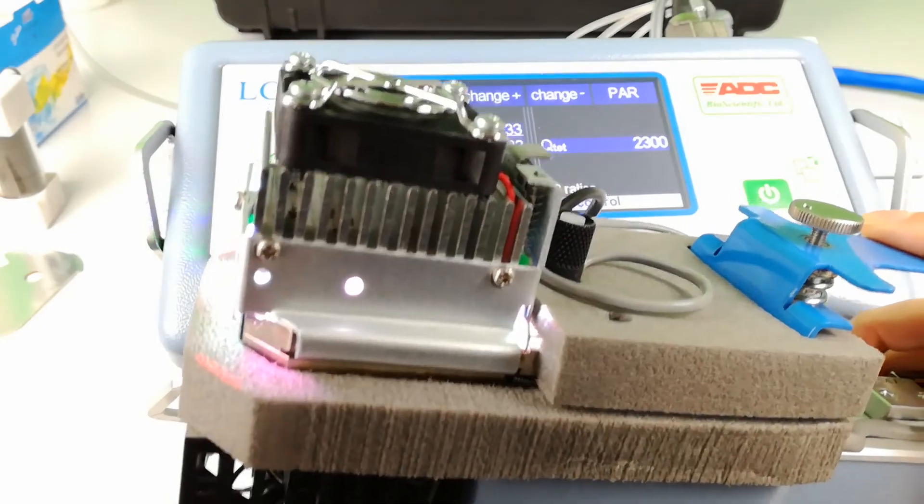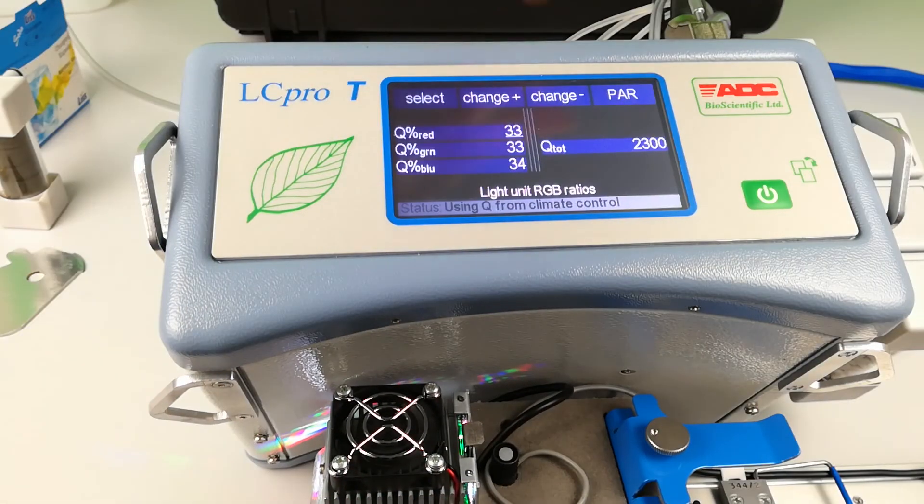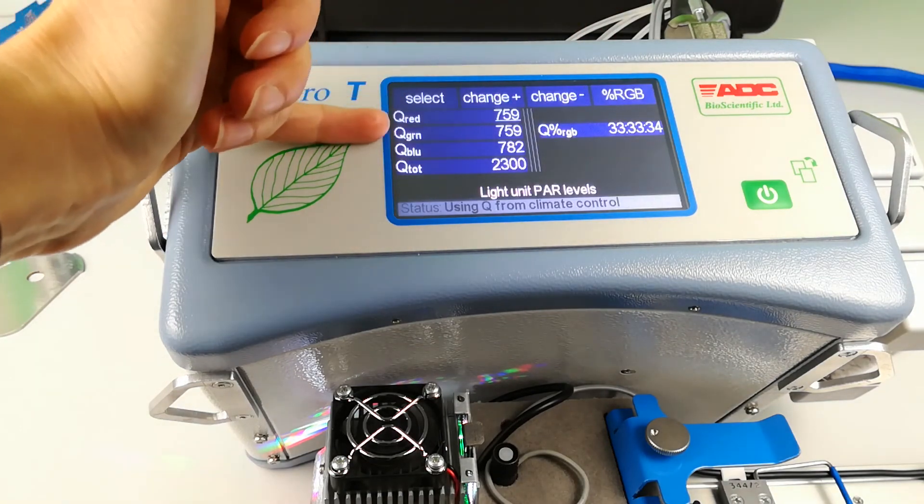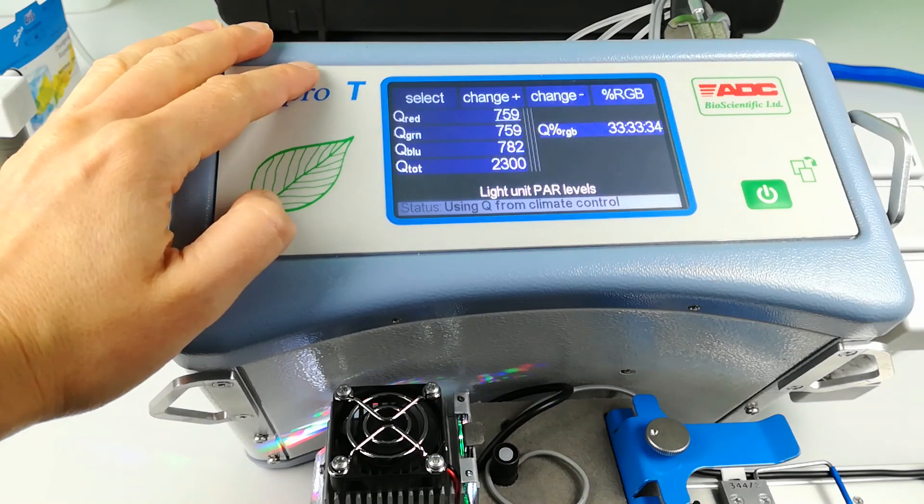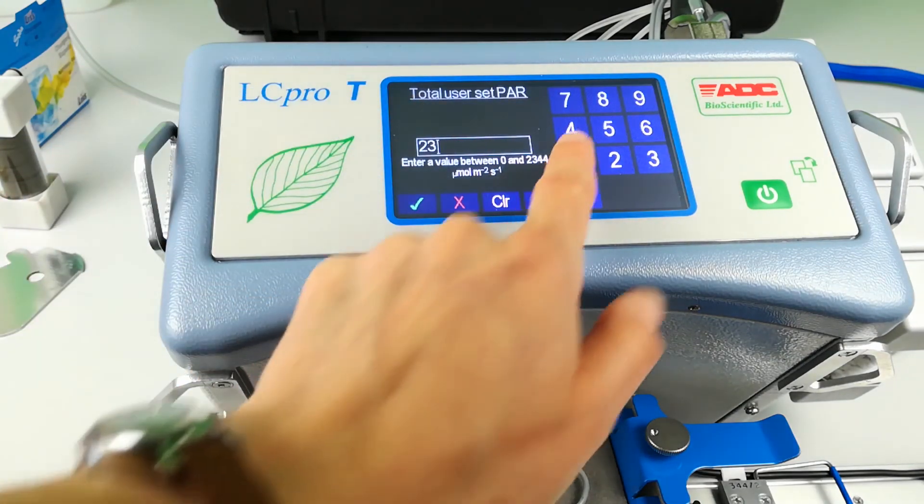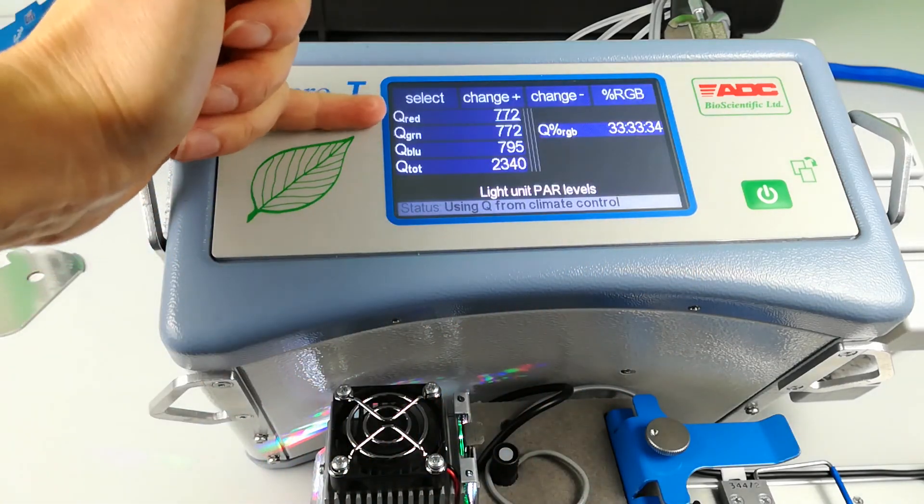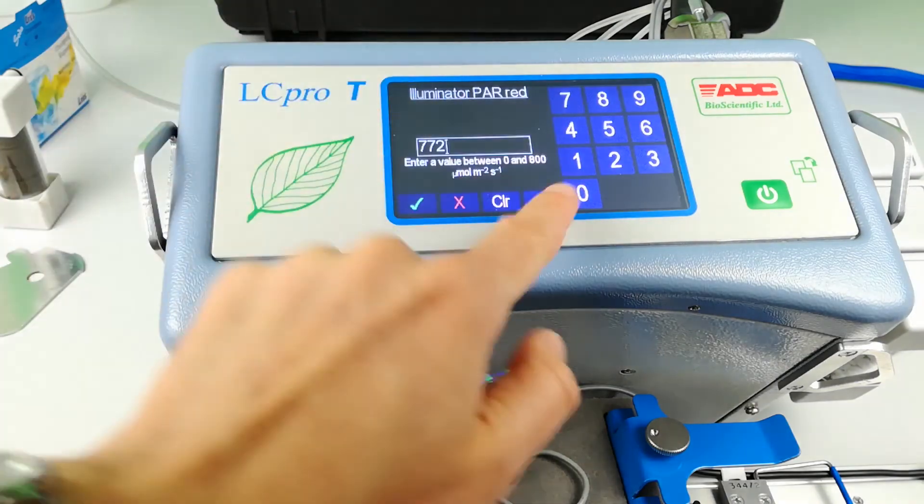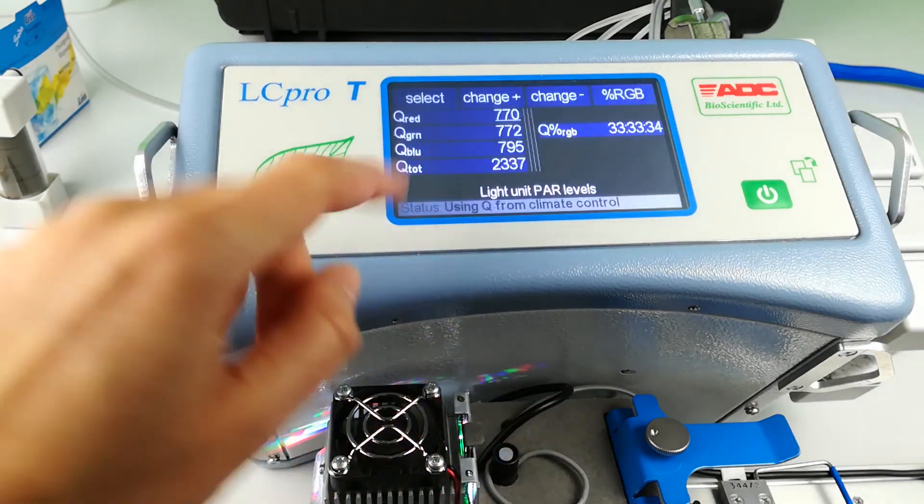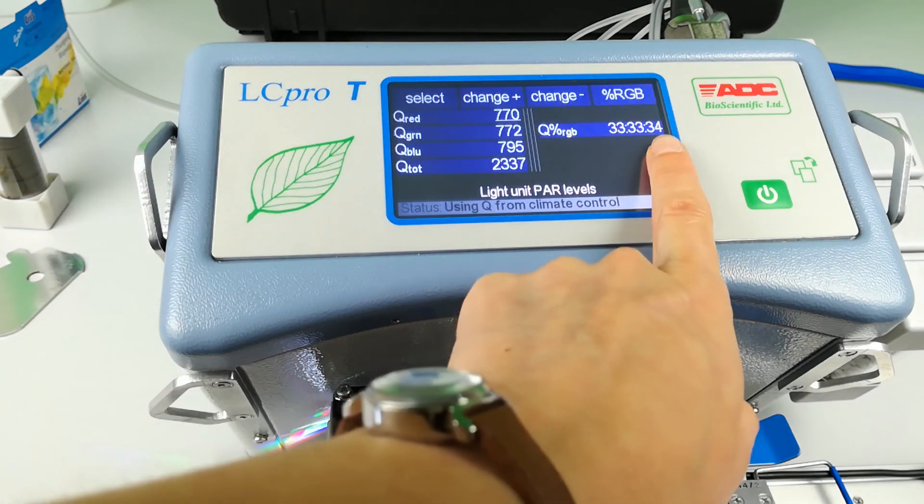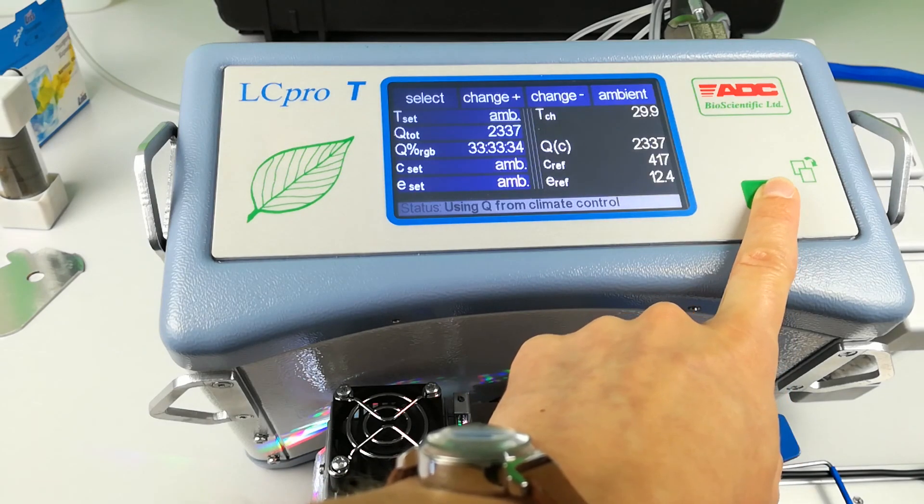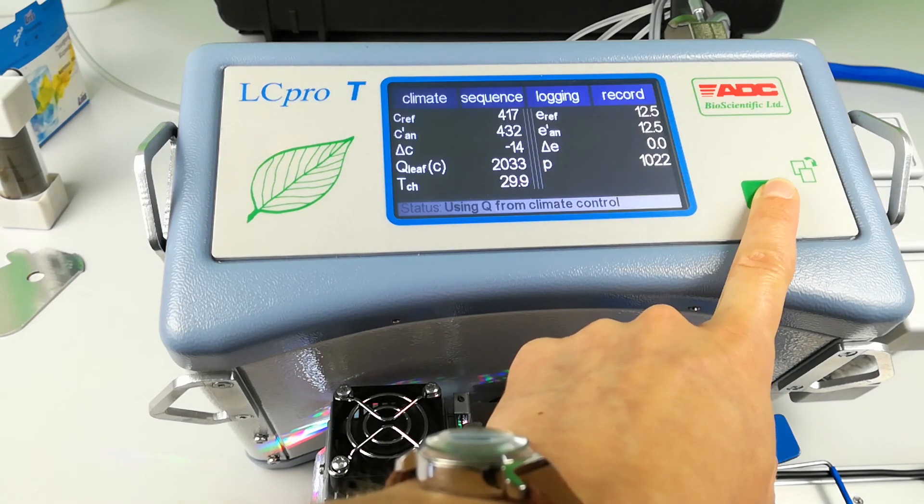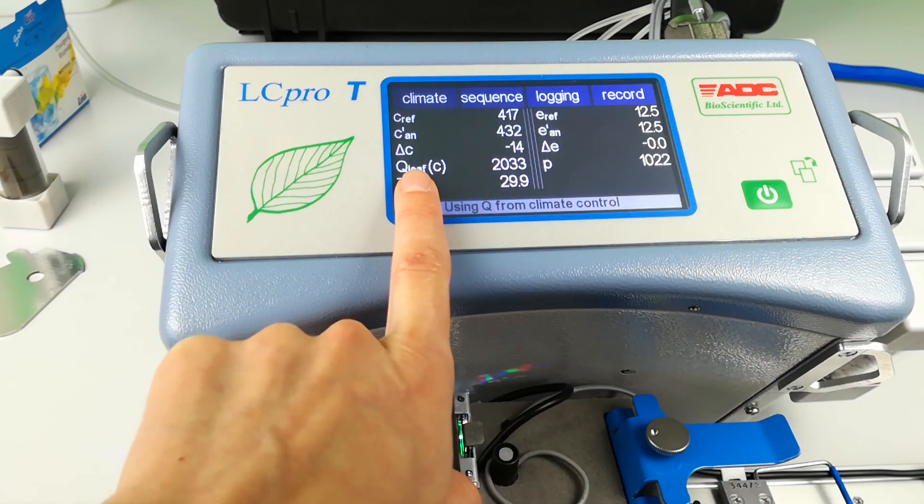Choose the PAR option at the top right and here you can see absolute values rather than percentages, for each of red, green, blue and total. Changing the value from this screen would change the ratio unless you only change Q-Total. These two options allow great versatility when programming experiments to replicate natural light, or taking measurements under different conditions.